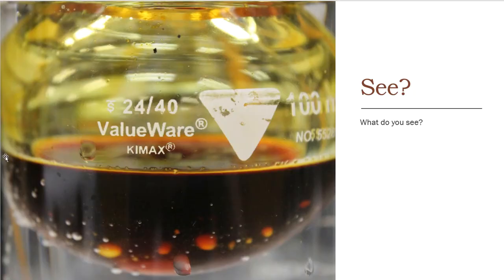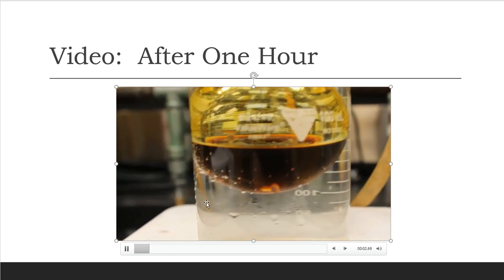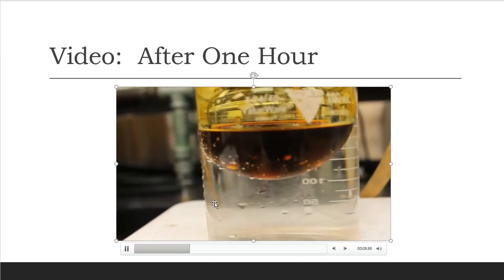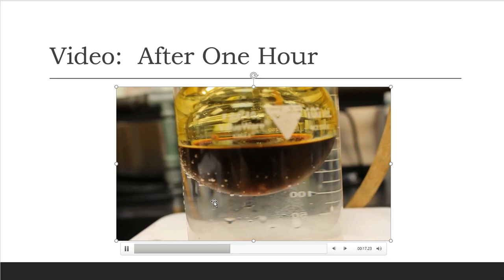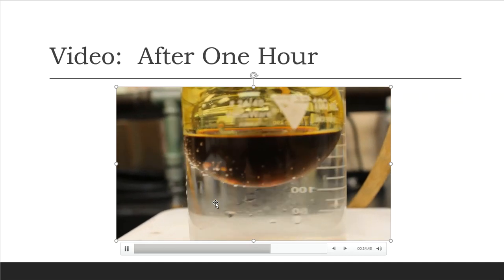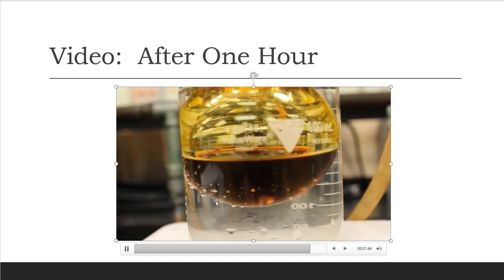All right, so as I begin to sit and wait, this is what I begin to see. So you can write down your observations. What do you see? And then here is a video that's after that 1 hour time period. So this is after the 1 hour wait period. I've stirred, I've let this sit for 1 hour in total, and now I'm getting ready to go on to the next step. But before I do, I just want to give you some observations so that way you can write these in your lab notebook. So this is the solution after the 1 hour wait period before we go further. All right, so make your observations as you see fit. Just make sure you put them in the lab notebook because observations are one of the most important things.